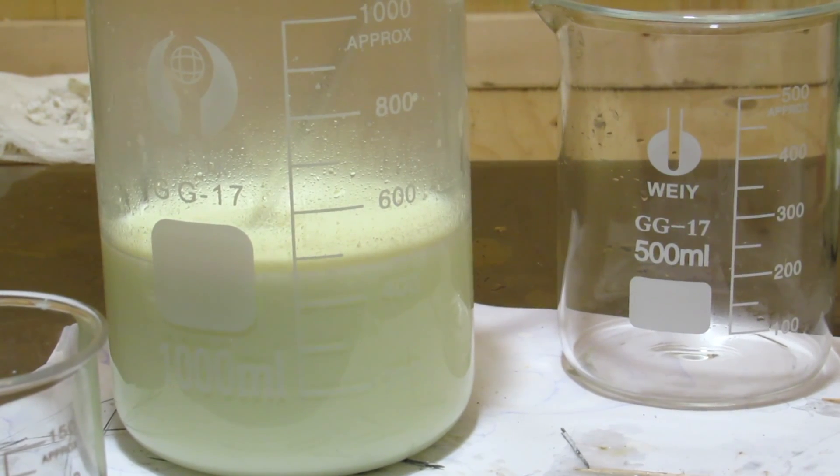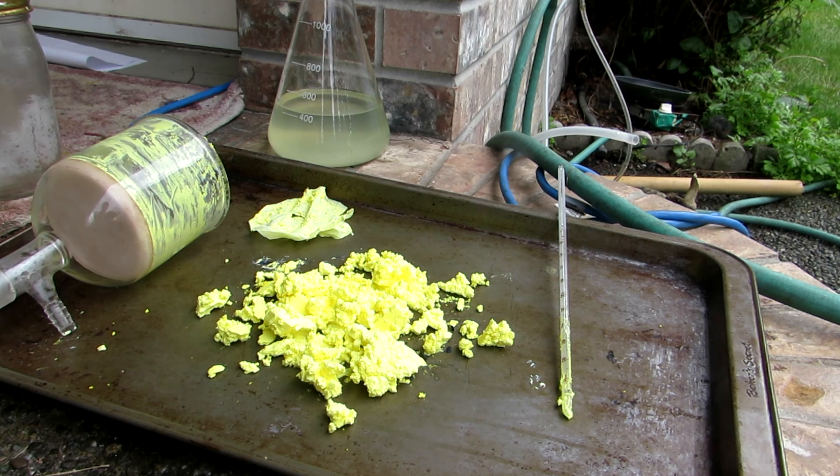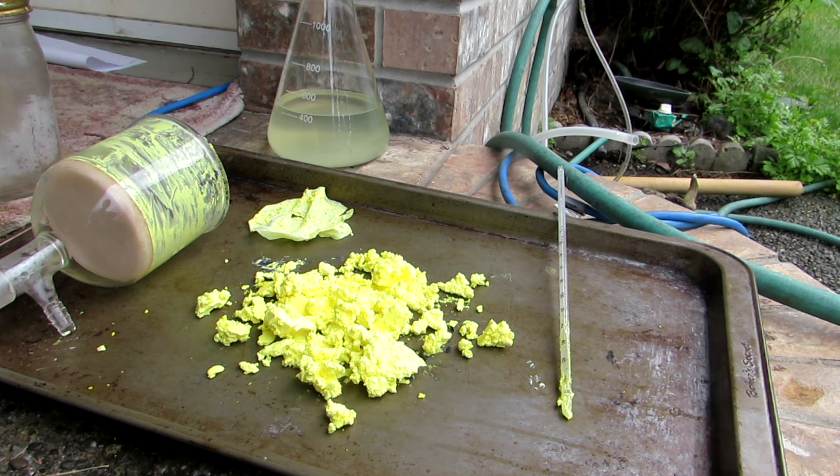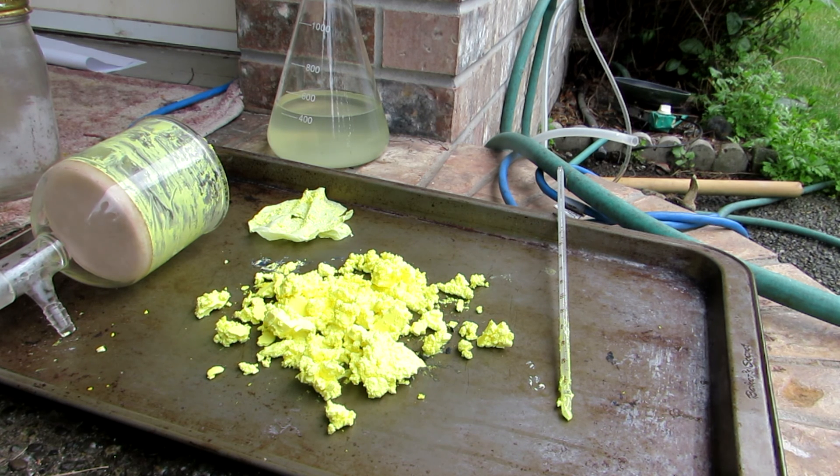However, after mixing the solution, it took on a light canary yellow color. The solution was vacuum filtered and then transferred to an oven at about 150 degrees Celsius to decompose the tungstic acid to tungsten trioxide. The decomposition occurs around 100 degrees Celsius.